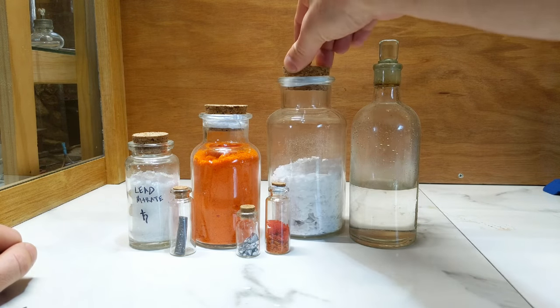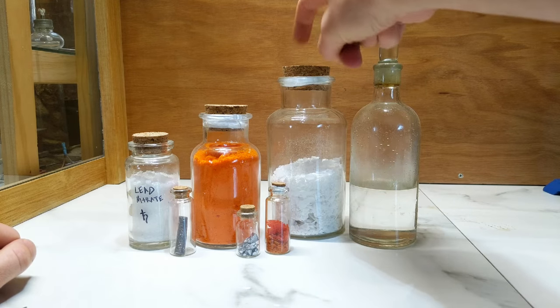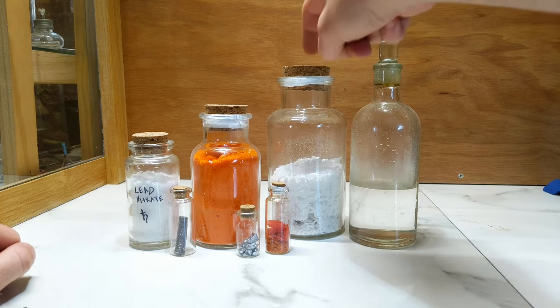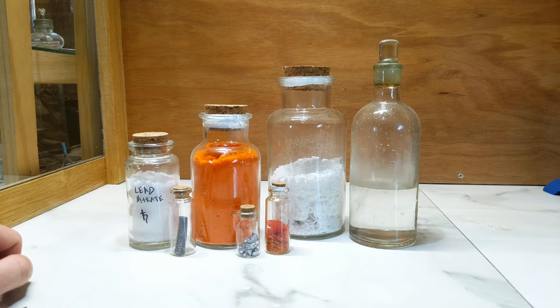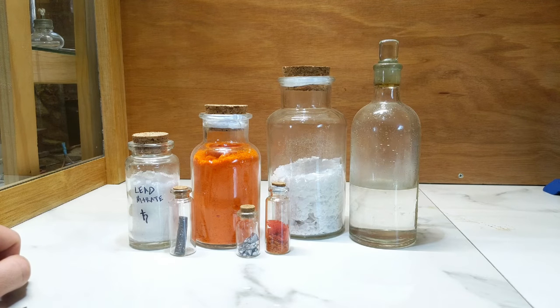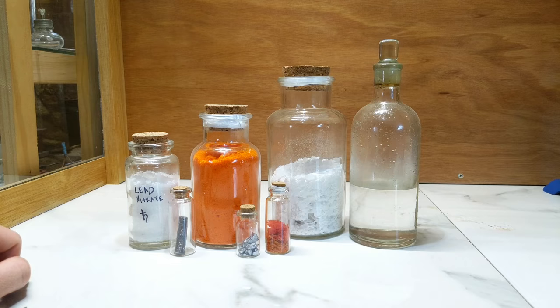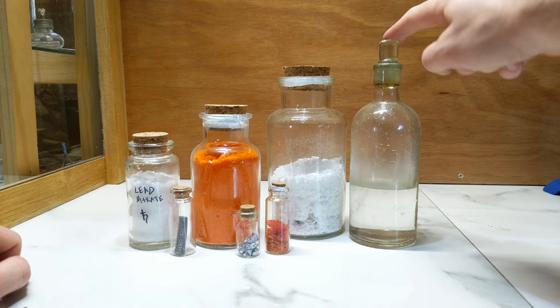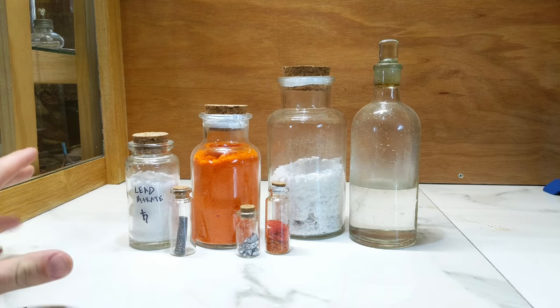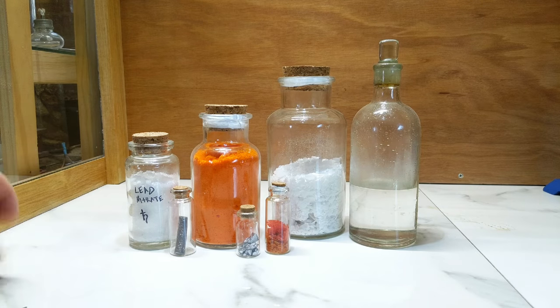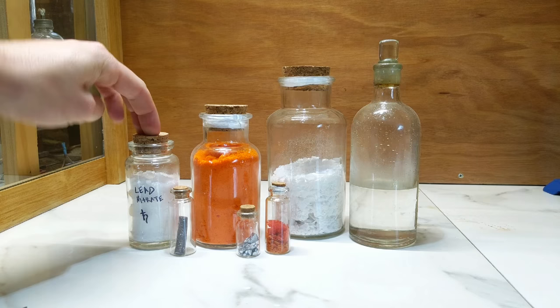Up the back here we have some potassium hydroxide, which is an alkaline which we'll be using at a later stage for making some of the orange and red variants of the chromate pigments. And we also have some sulfuric acid here too, which will aid us in making some of the lighter lemon yellow variants of the chrome pigment.